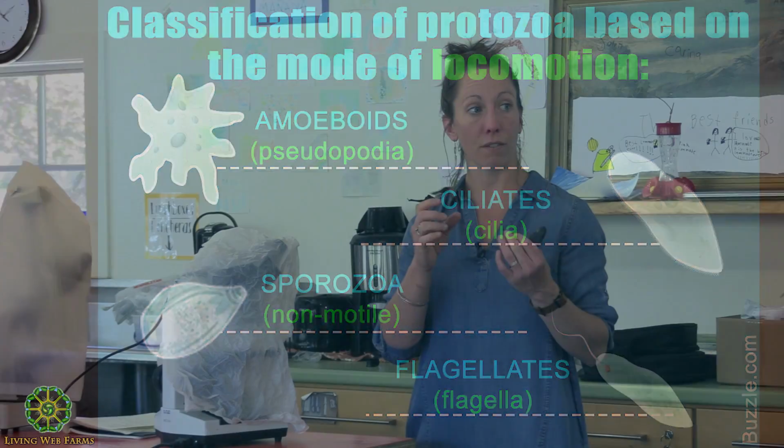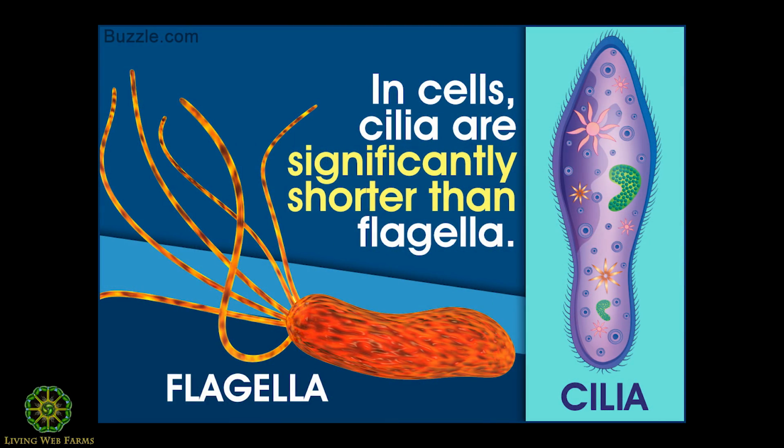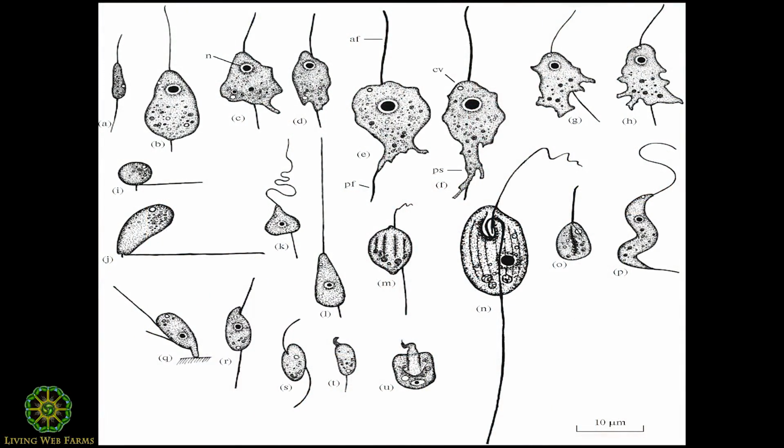and that's how you'll know it's a flagellate. If you see a protozoa-looking structure with a bunch of tiny little hairs all over it, or tiny little hairs on the front or the back, that's going to be a ciliate. So the difference is cilia are little tiny hairs. You have them in your throat, to help food go down. Unless you're a smoker, you've burned them all off. And so the ciliates have the little hairs, the flagellates have the longer whip-like structure.